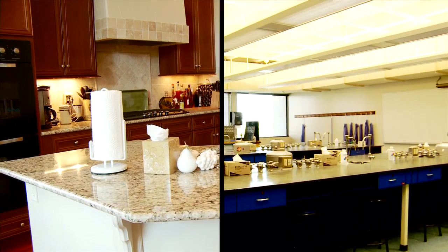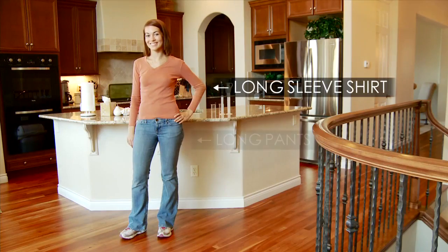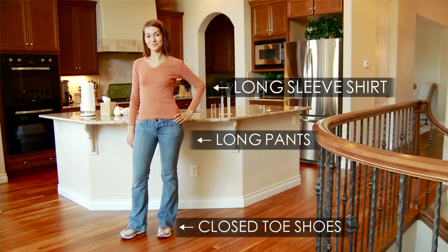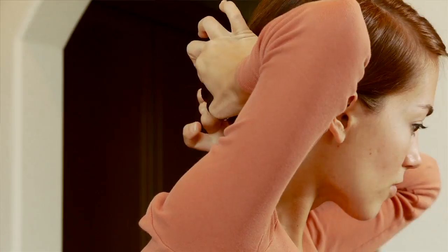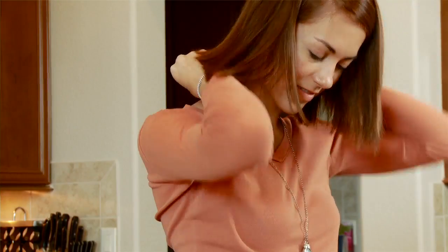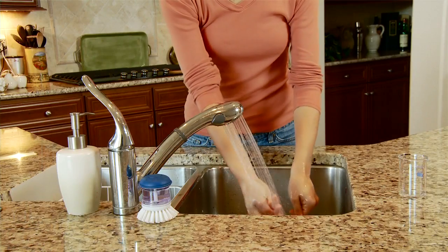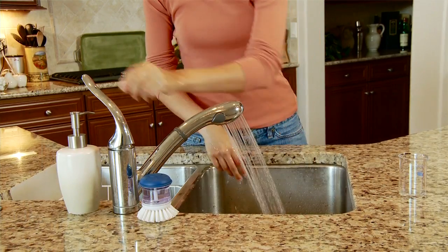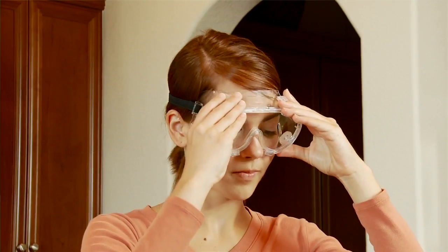Whether at home or in a campus lab, prepare yourself to do lab activities wearing proper clothing, tying back hair, and removing dangling jewelry. Make sure to wash your hands carefully before and after handling laboratory materials, and wear the safety gear.